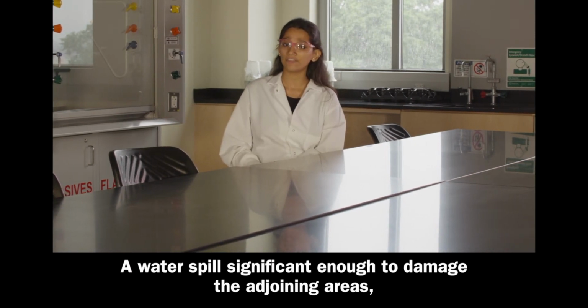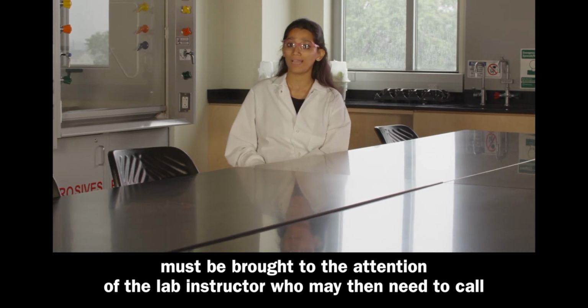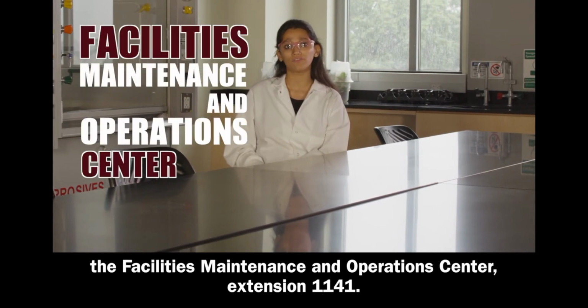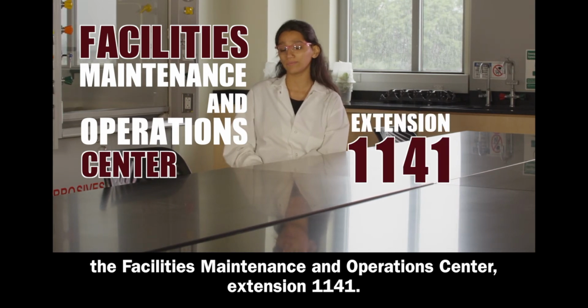A water spill significant enough to damage the adjoining areas must be brought to the attention of the lab instructor, who may then need to call the Facilities Maintenance and Operations Center, extension 1141.